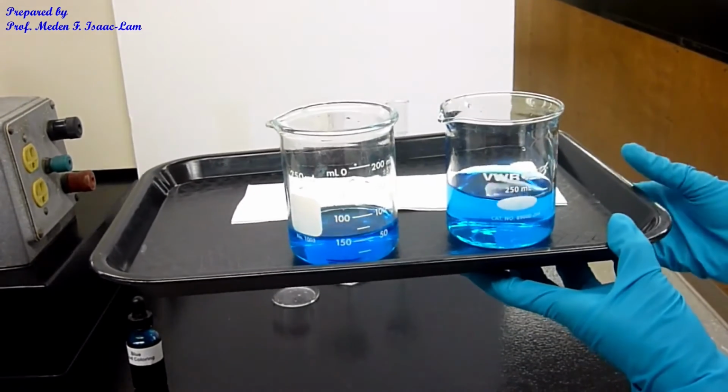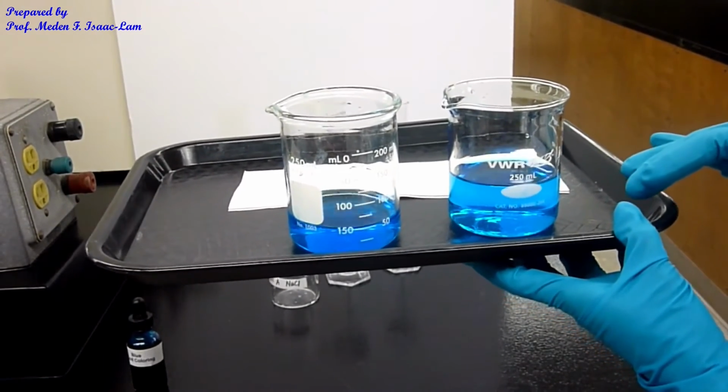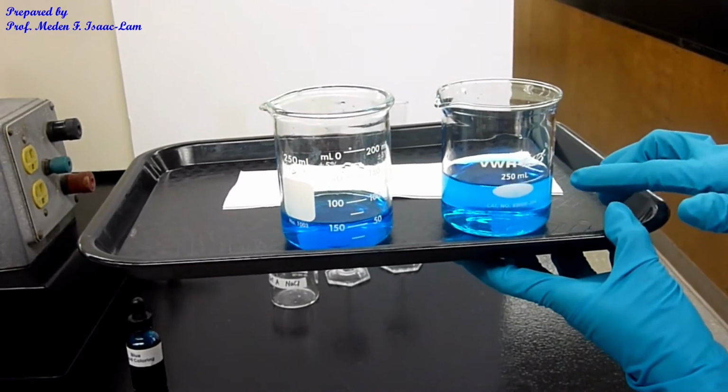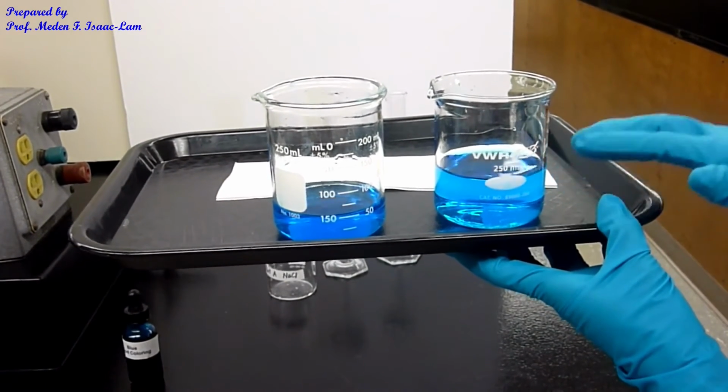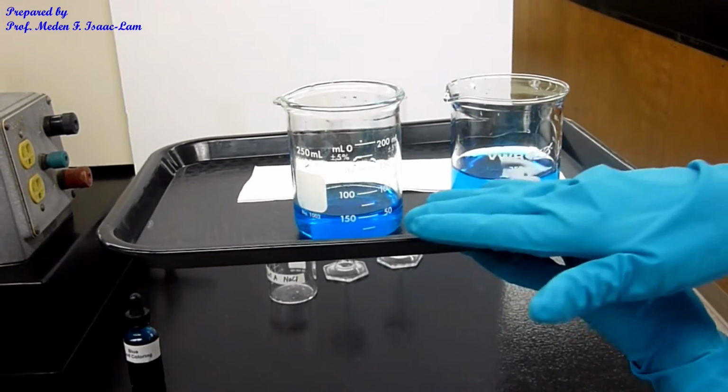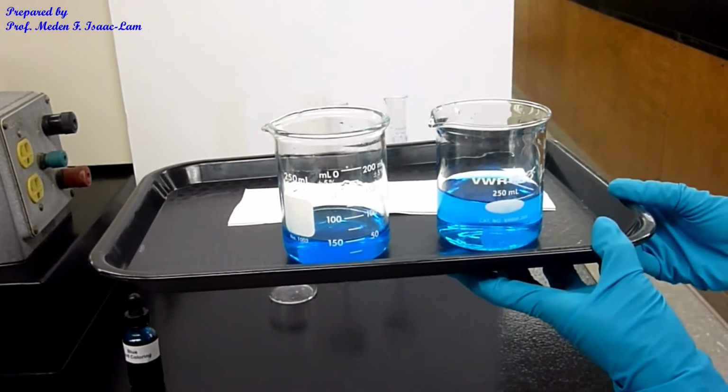So now you are going to determine the concentration of the diluted one. Obviously the concentration here will be less than the one on the left side.